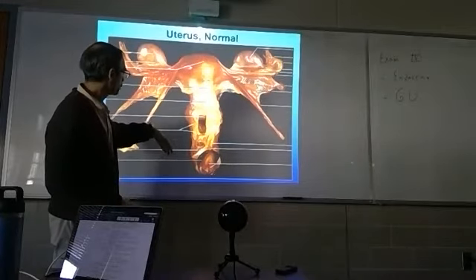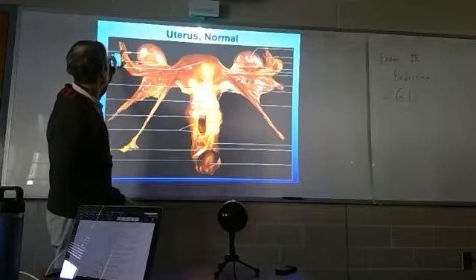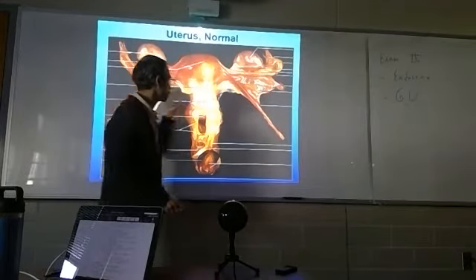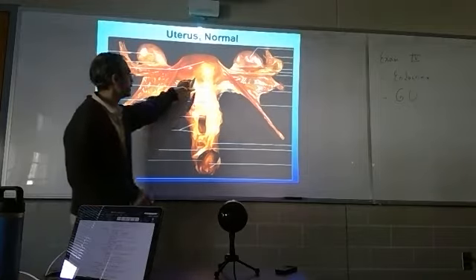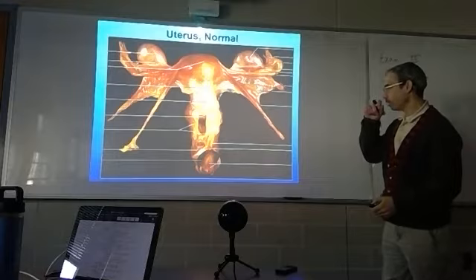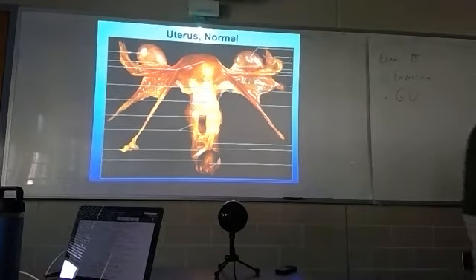You can see a normal specimen here attached to the vaginal canal. Here's the uterus. That's the cervix, the fundus. You can see the fallopian tubes, the fimbria up here. Ovaries here. You can see the suspensory ligaments here. Everything looks normal. It has a kind of tan color to it. Again, everything in this specimen.